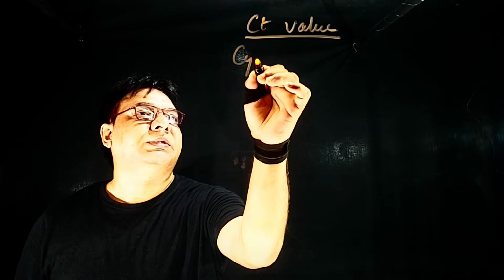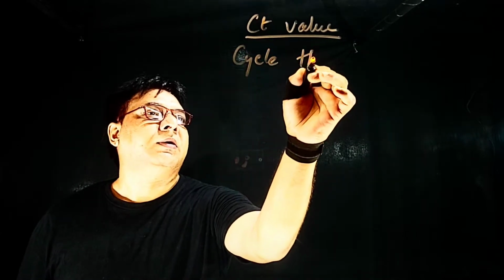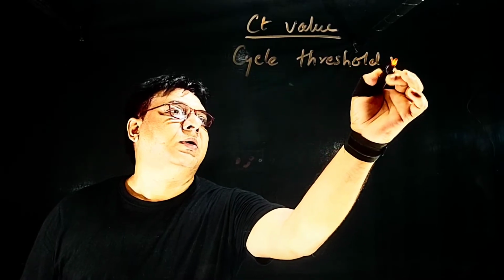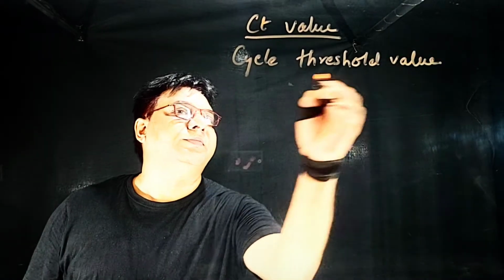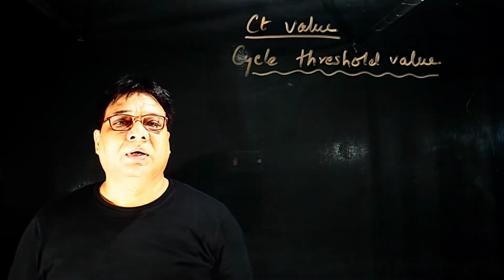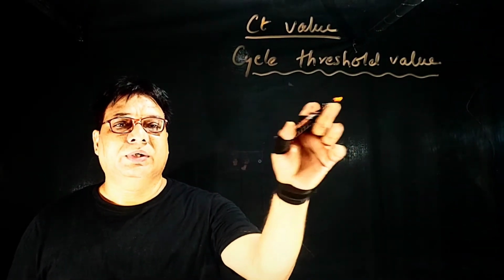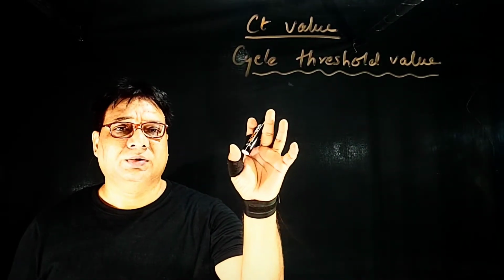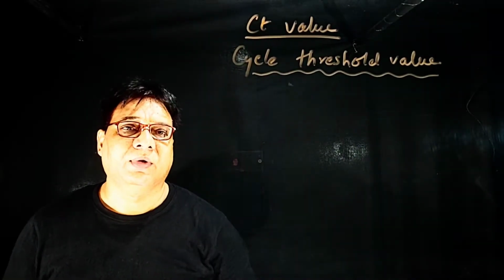CT stands for cycle threshold value. When you get your RT-PCR report, you get this CT value written on it also. And everybody has come to know this term, CT value.